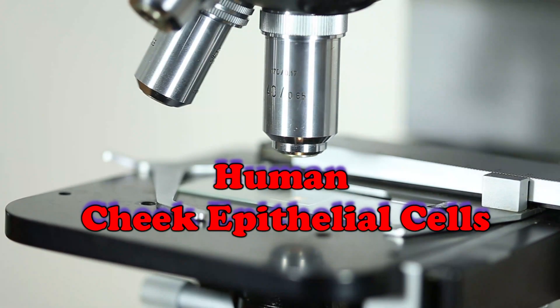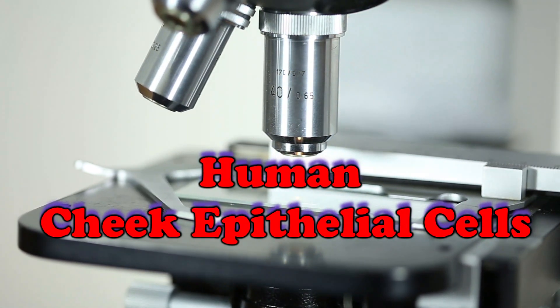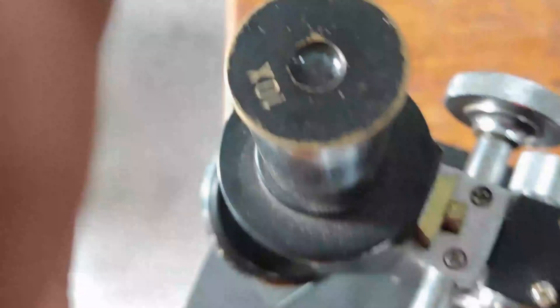Human cheek epithelial cells. Let's have a look at how cheek cells look under the microscope.